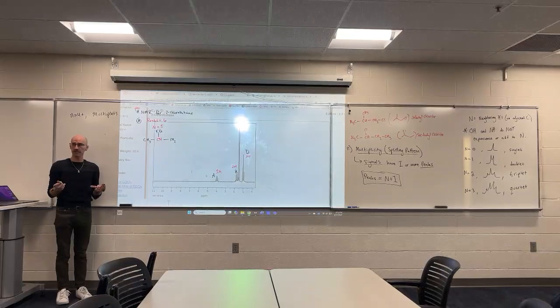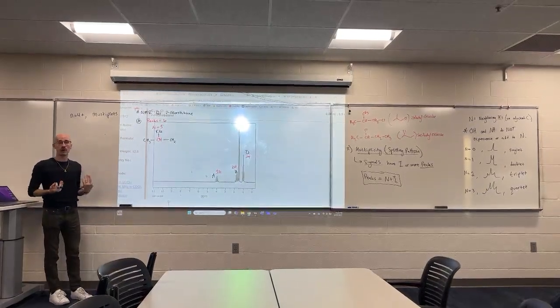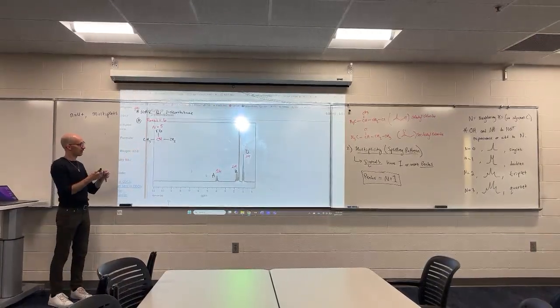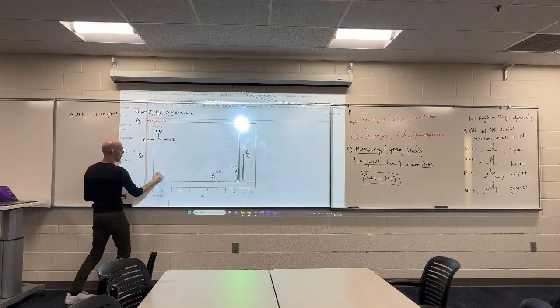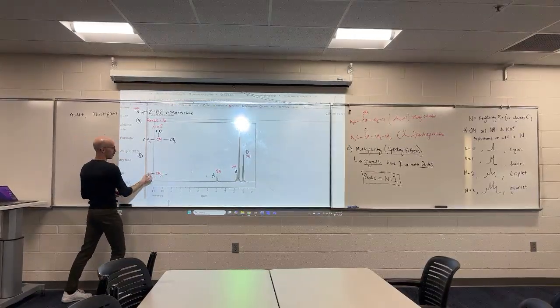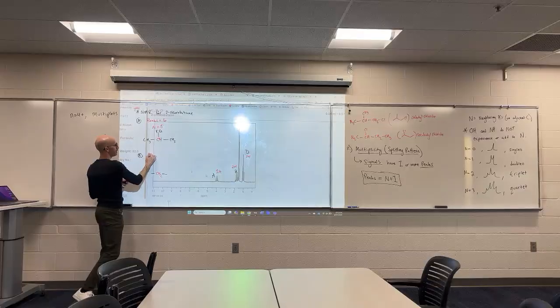Does that seem valid? That's why the hydrogen signal is so far left, because it must be functional group adjacent with these 5 neighbors. All right, signal B integrates to 2H. So we know we're looking at a CH2 with 2 groups. How many peaks on this?